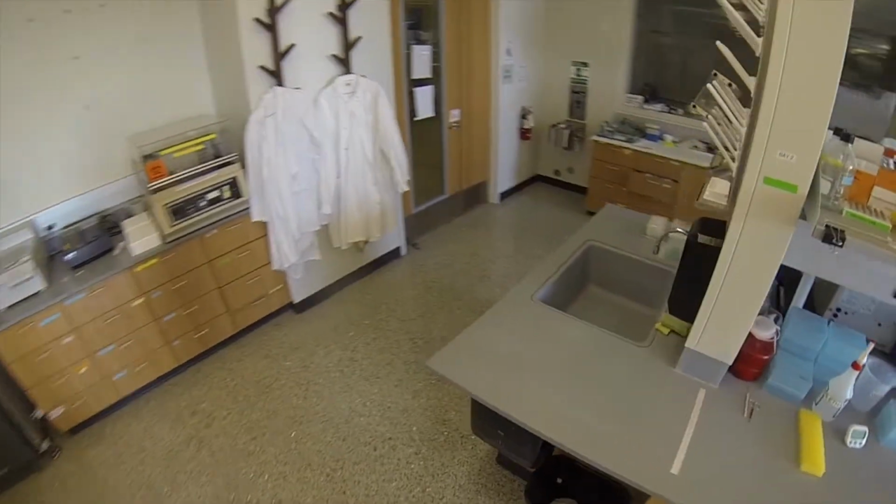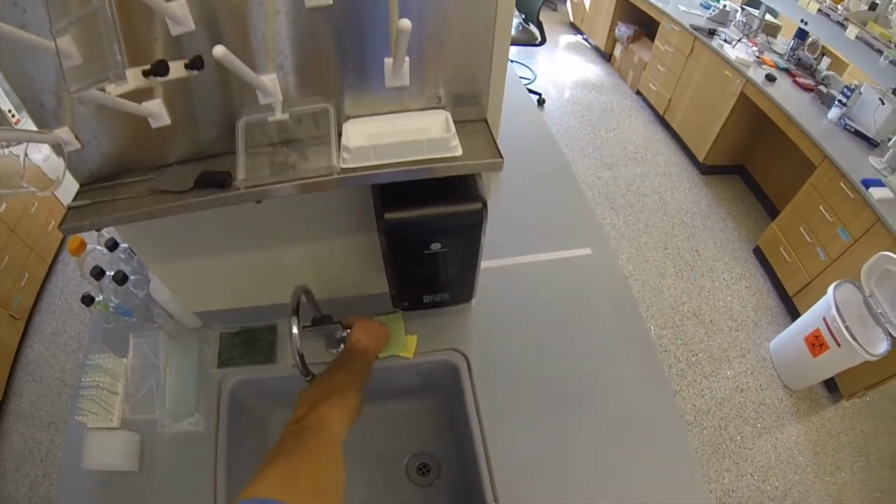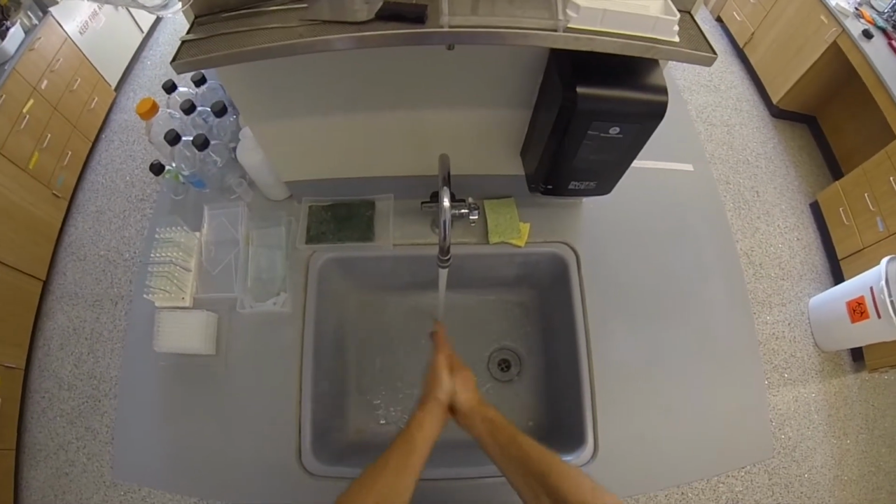As soon as you arrive to lab, the first thing you're going to do is wash your hands, put on gloves and a lab coat, and then wipe down your lab bench with 70% ethanol.